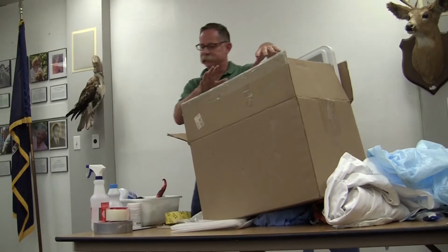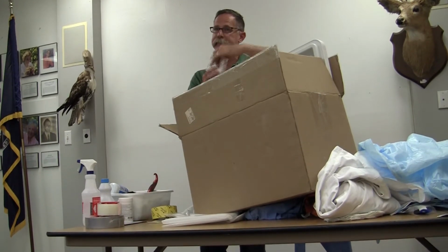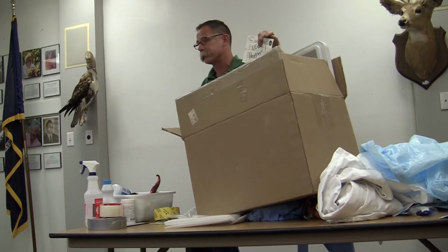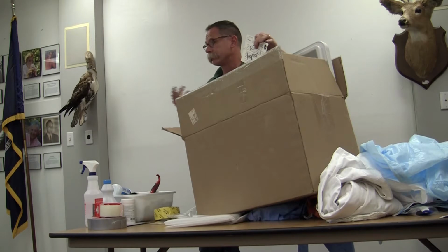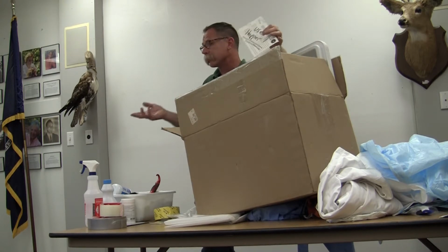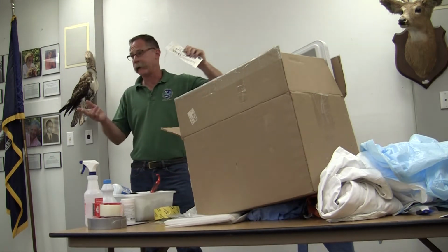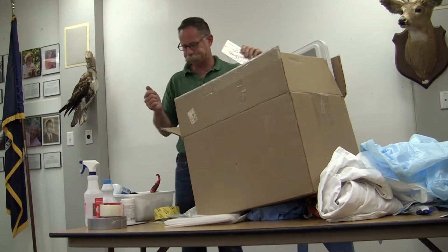So you want to make sure you've got enough equipment on there. You're going to have some kind of specimen tag to identify the specimen, especially if you've got more than one specimen in there and they're from two different places and they might be the same species. We can tell apart a gray squirrel and a red squirrel, but if it's the same species, we might not be able to tell which one's from which, and that happens more than you might think.